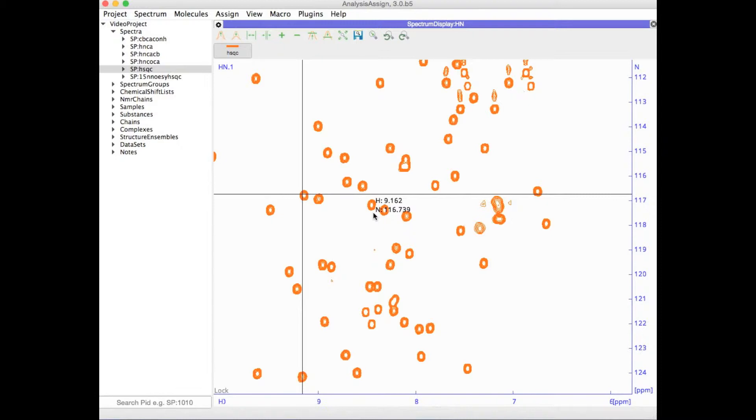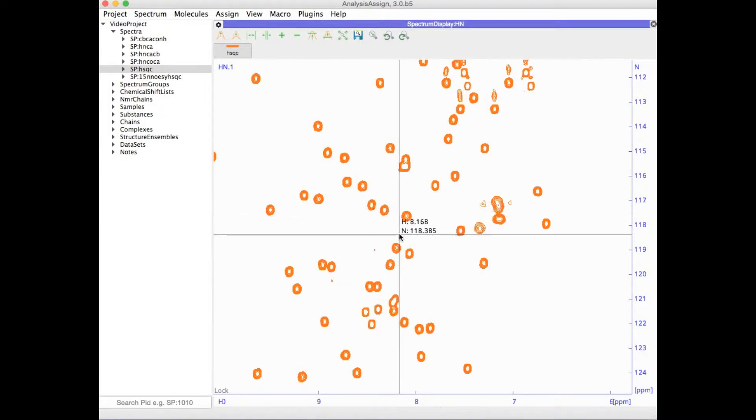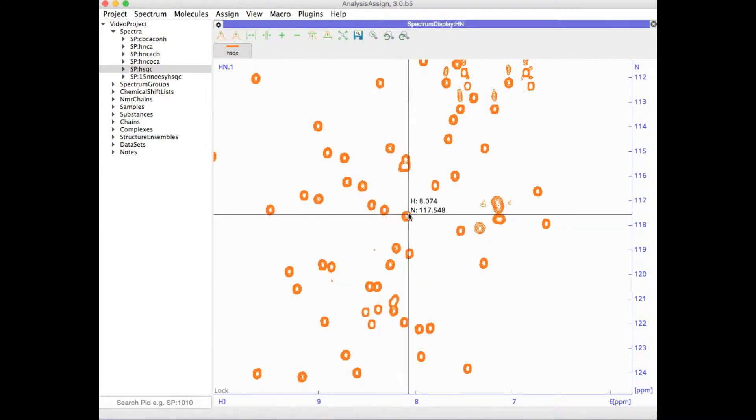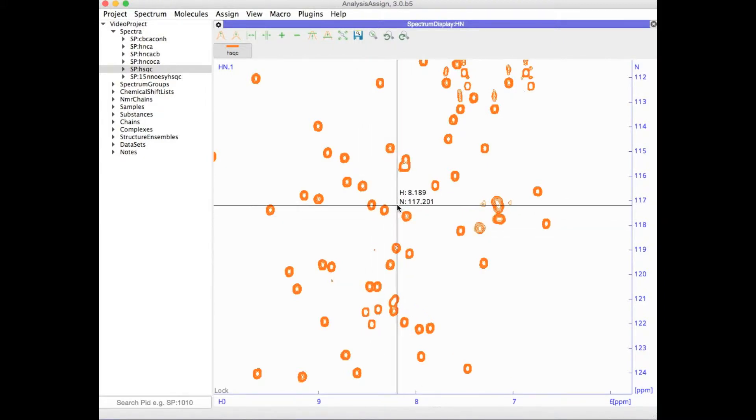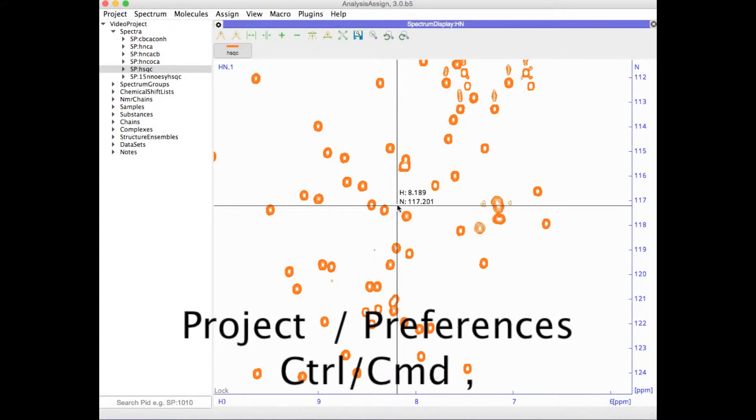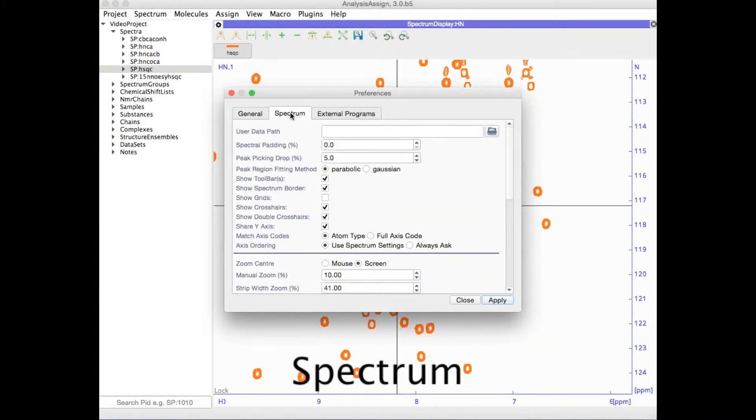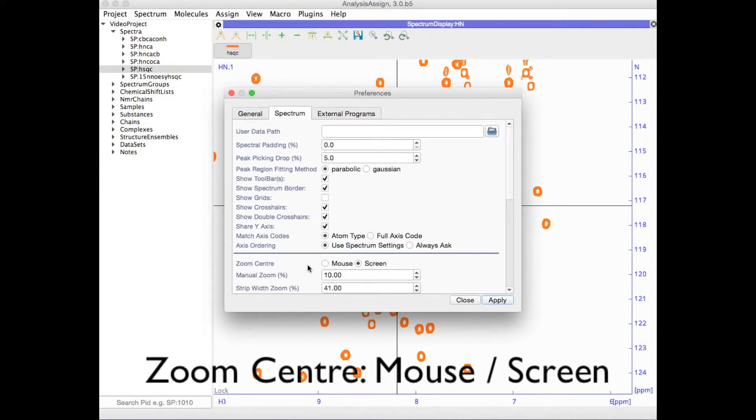You can set whether the zoom should be centered on the mouse position or on the middle of the spectrum display. Simply go to Project Preferences, type Control or Command comma, then go to the spectrum tab and under zoom center select mouse or screen.